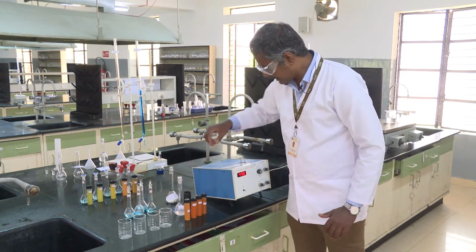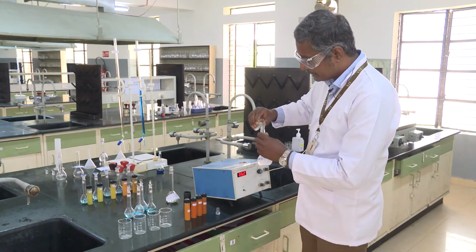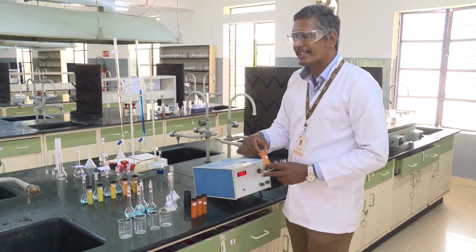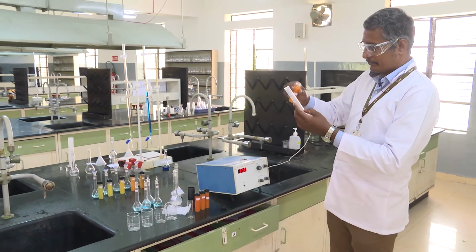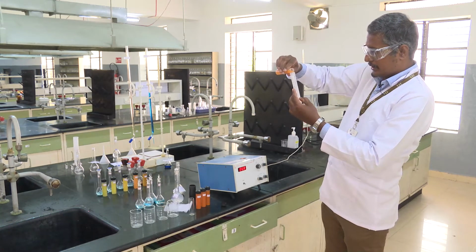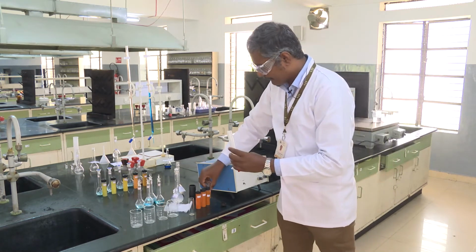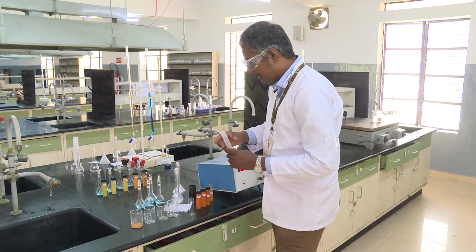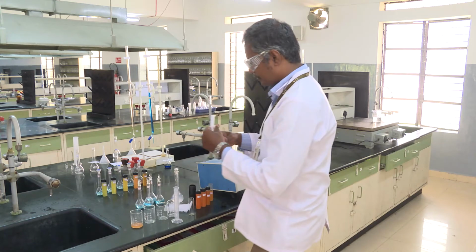So now the next task is to measure the turbidity of the samples A, B, C, and then D. We have to take 10 ml of this solution and transfer it into a beaker, and then we need to add the conditioning agent.